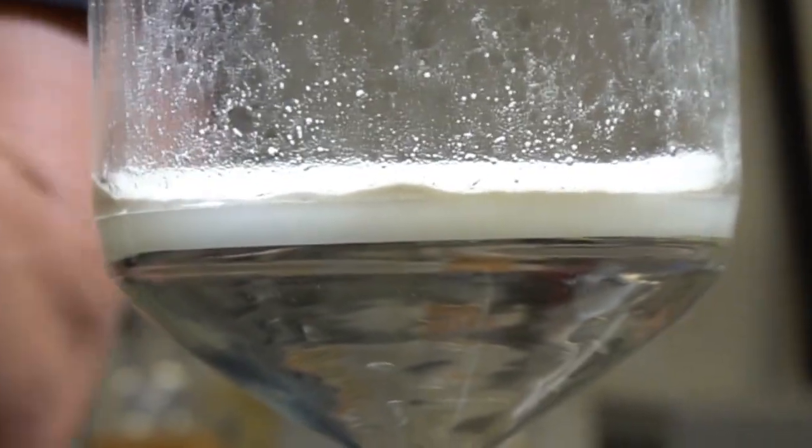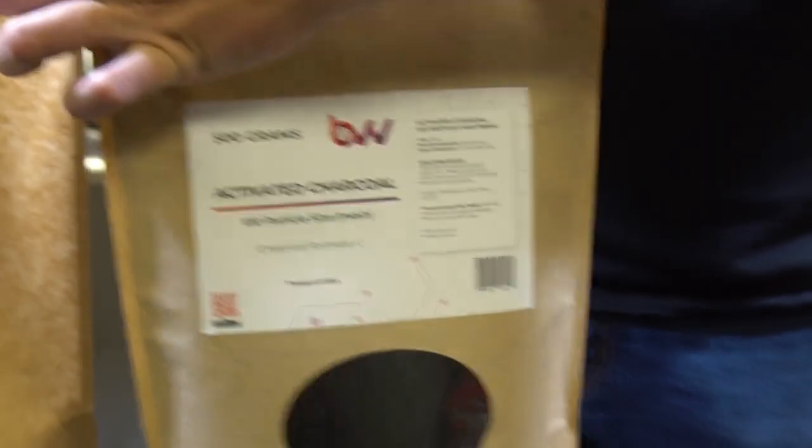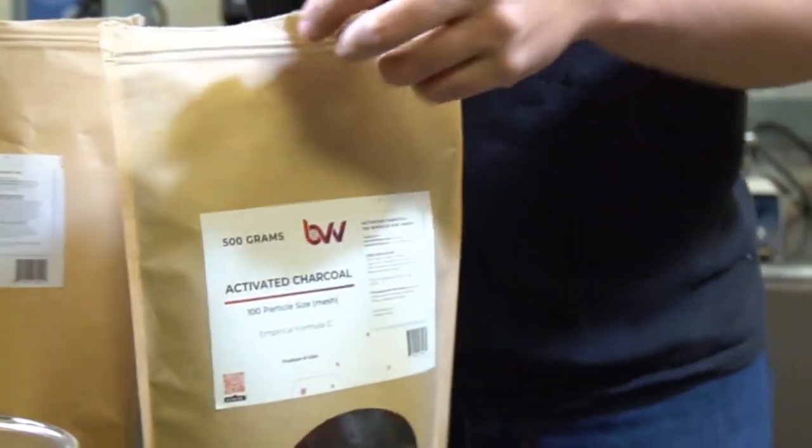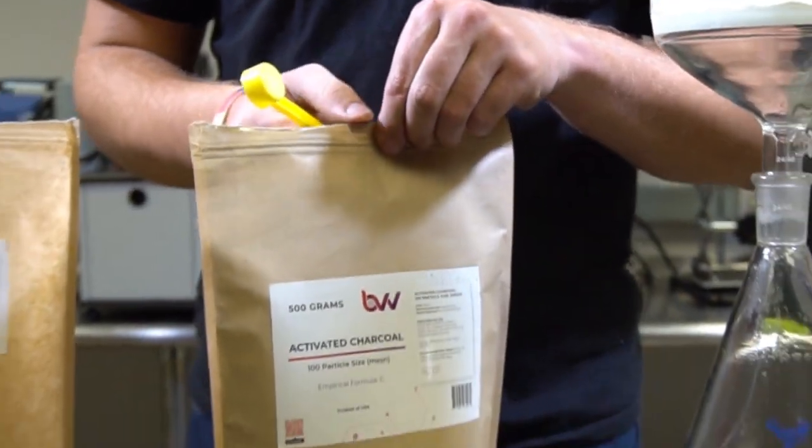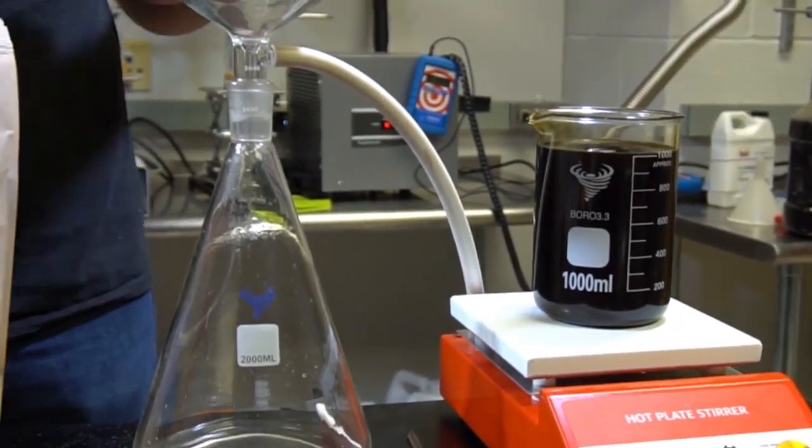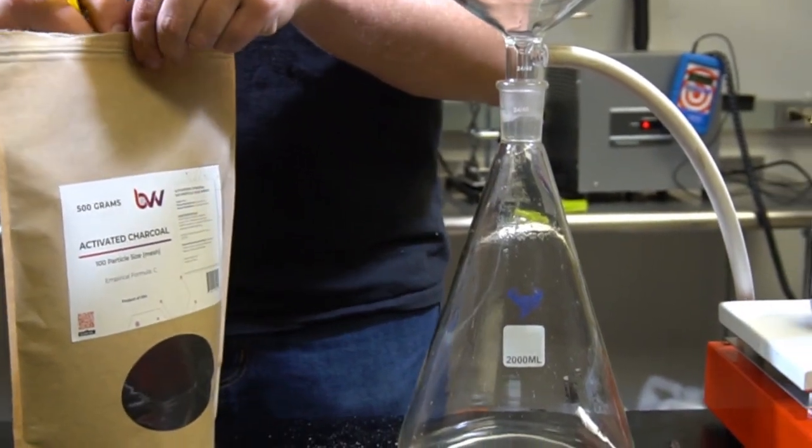Next I'm going to add some activated charcoal. You can add two scoops in this little scooper for every 250 milliliters of solution. Right here we have a thousand milliliters of solution. So I will put in eight scoops to my Buckner funnel.